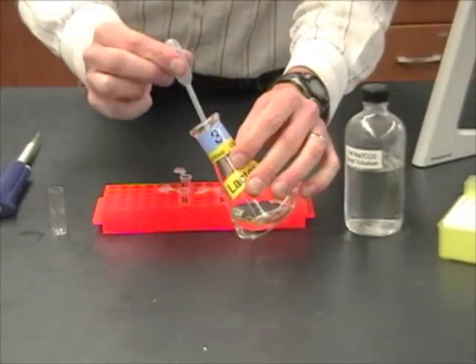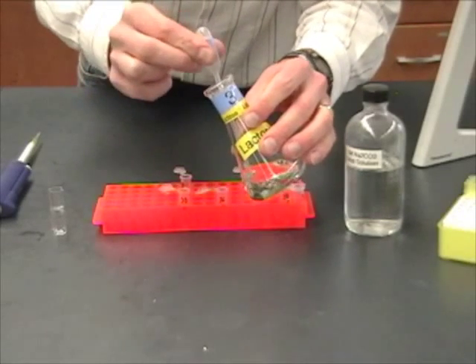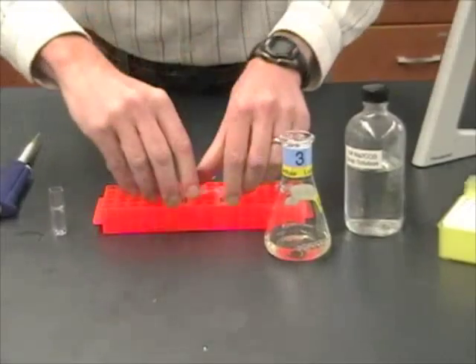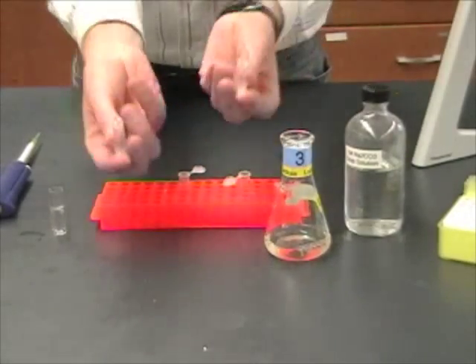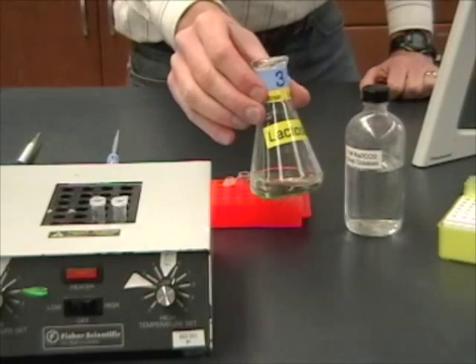I've got my sample, and now I'm going to put one mil in the cuvette and one mil in each of the tubes B and C. I'm going to start my stopwatch again for the reaction time, close these, mix these up, and put them into the heat block. Then I'm going to take my flask back to put in the incubator.